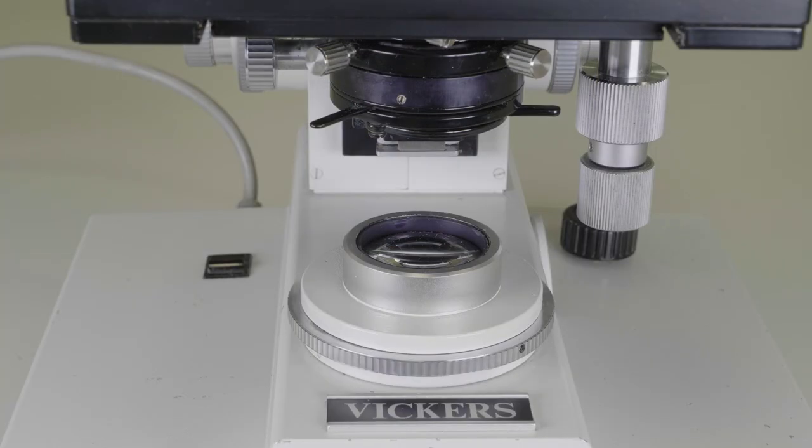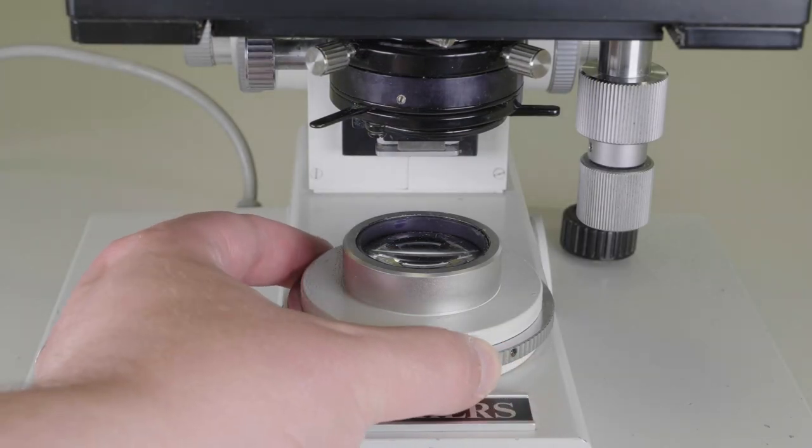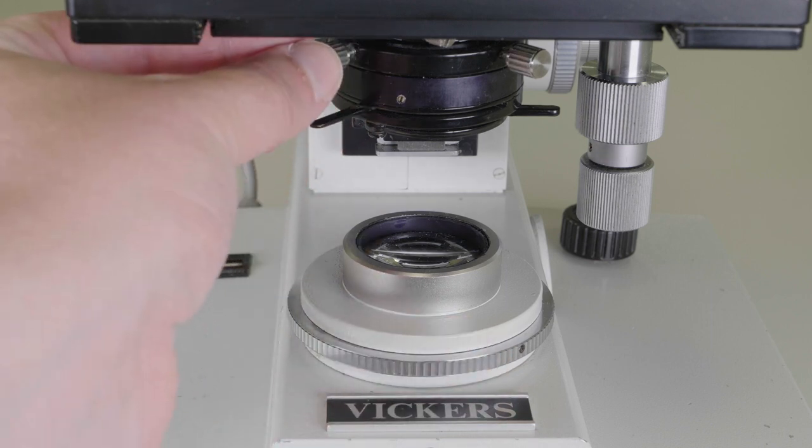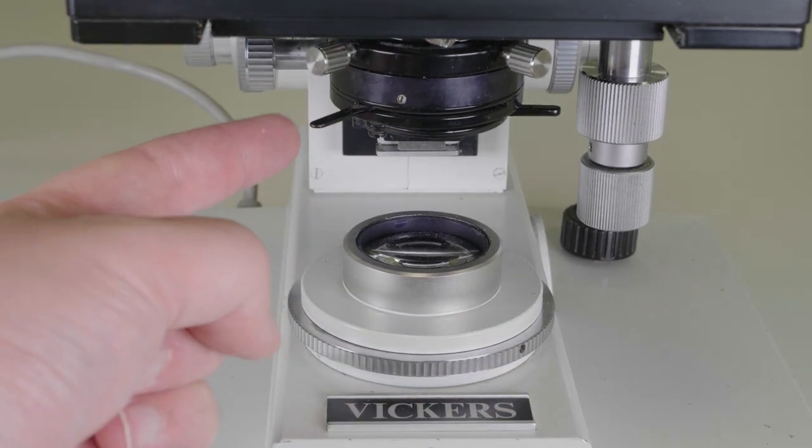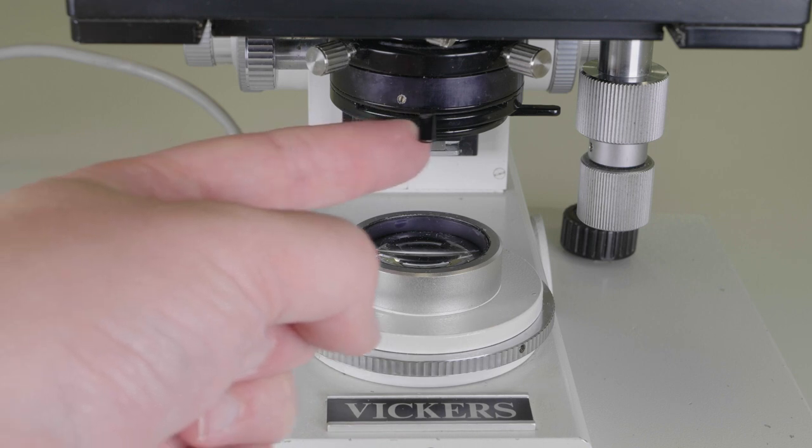The Vickers microscopes are very similar to the Olympus microscopes, the only difference being that the aperture iris is controlled by a slider instead of by a ring.